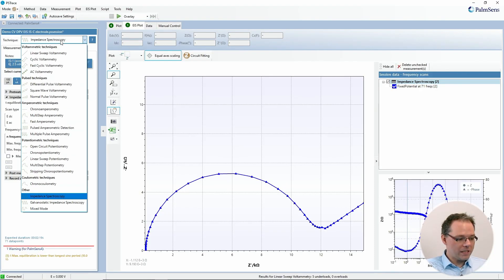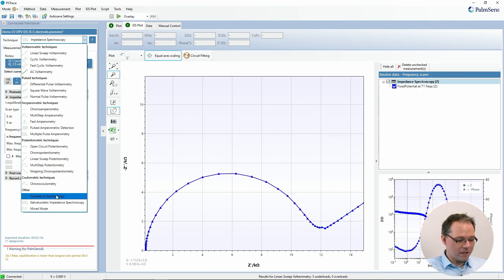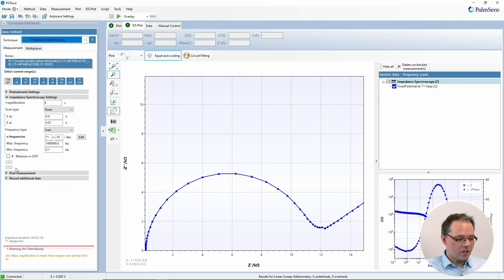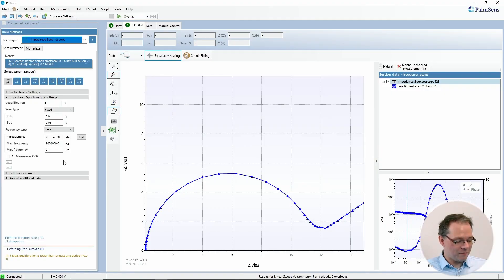In PSTrace you choose from the list of techniques impedance spectroscopy, and then you get this mask with all the parameters that you need to set for your impedance spectroscopy. To explain these parameters in more detail, I've prepared a few slides.